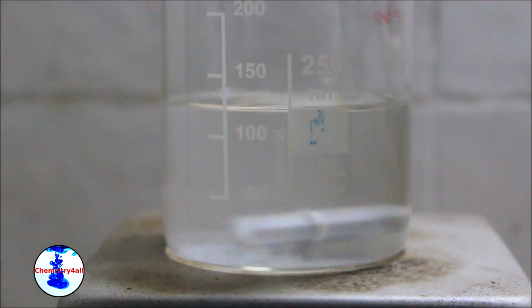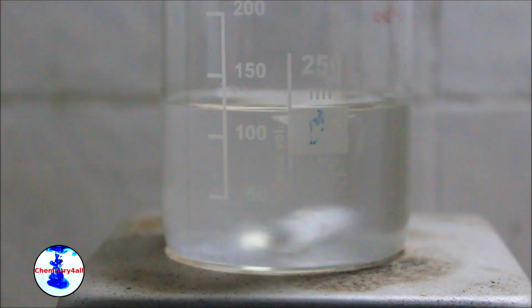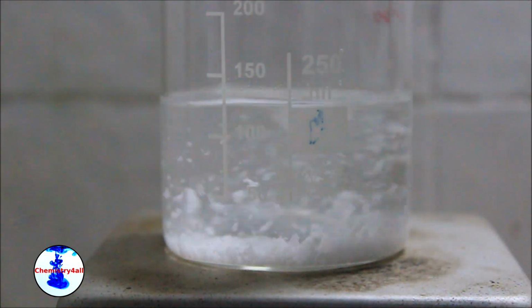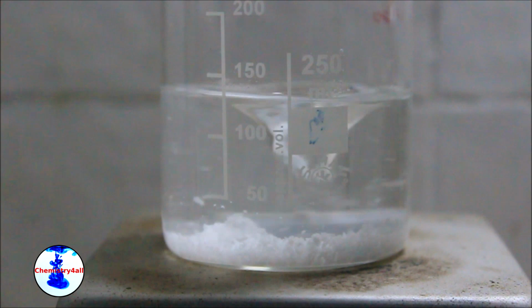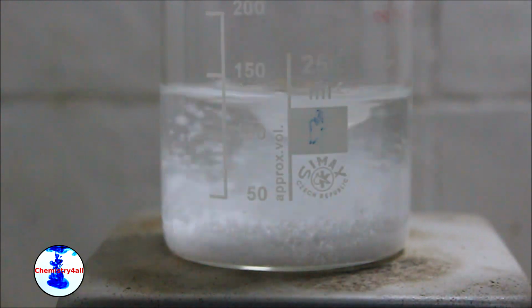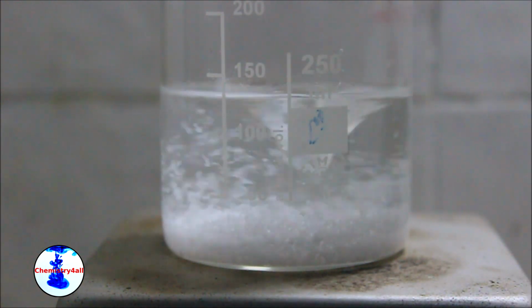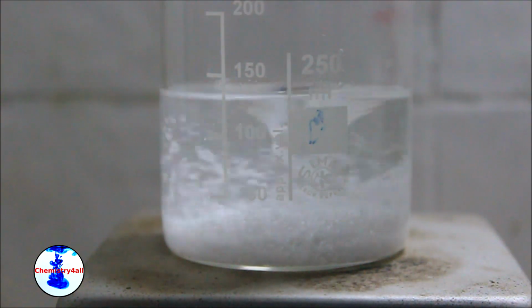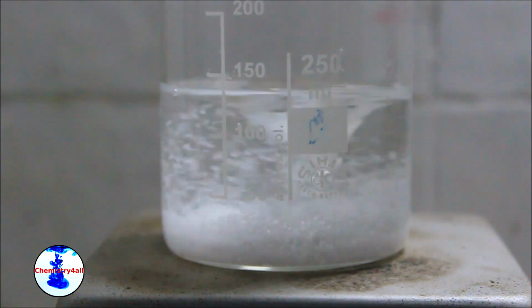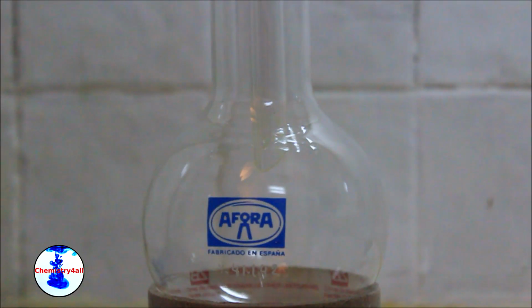As you can see, we are left with a kind of cloudy solution, which indicates that it contains large amounts of water. To solve this issue, we will add anhydrous magnesium sulfate, which should remove the majority of the water present within our final product. Indeed, as we can see, after adding a large amount of magnesium sulfate, the solution clears up, which means that most of the water has been successfully removed. The resultant suspension is then filtered and the solution is collected in a clean and dry round bottom flask.